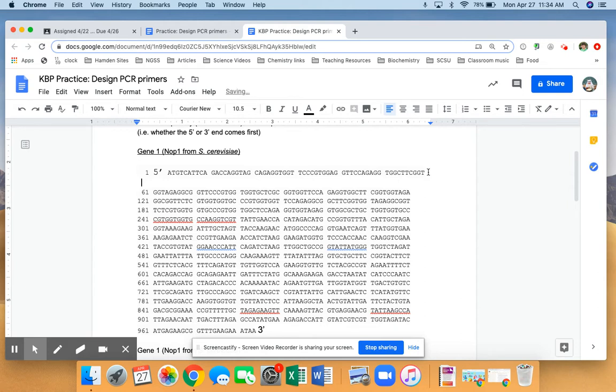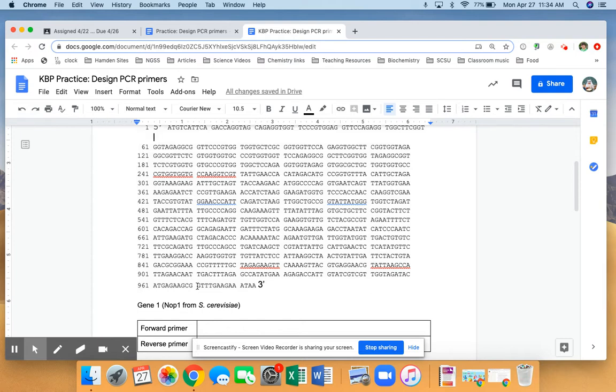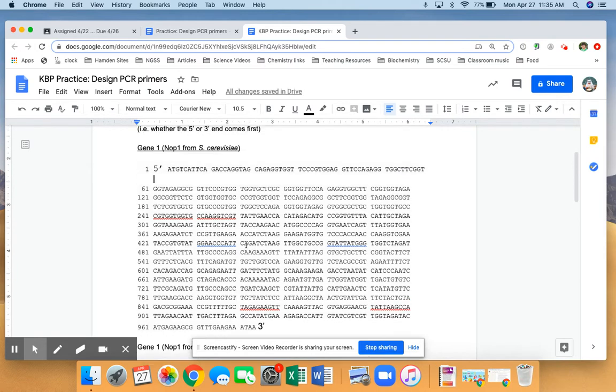All right. The other half of the gene is not shown because you can figure it out by just making the reverse complement. So I'm going to make the reverse complement to show you what the second strand is for both the top and the last line of this gene. Notice all of these markers here: these are 10 nucleotide groupings. This is 1 through 10, 11 through 20, 21 through 30, 31 through 40, 41 through 50, 51 through 60. The next line starts at 61. So this gene has a total of 984 nucleotides. And for the PCR products, I want them to be full length.